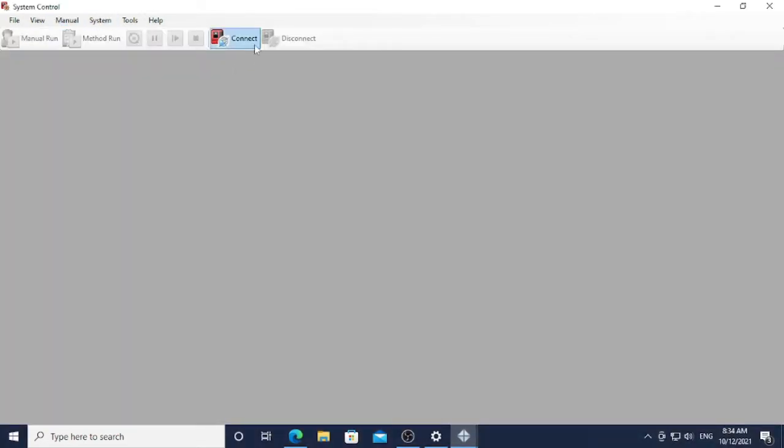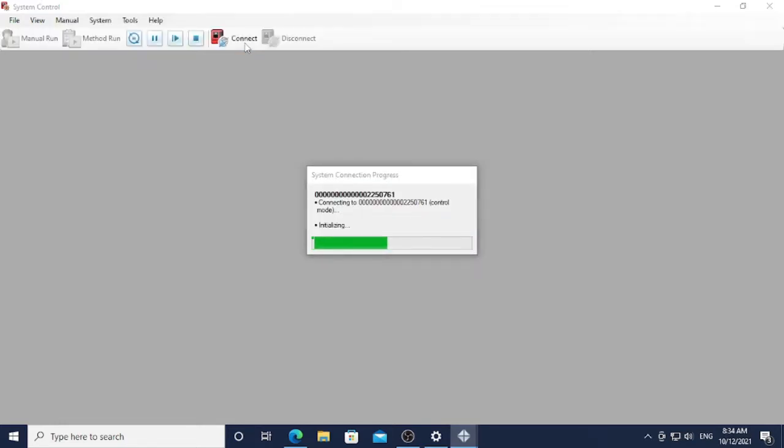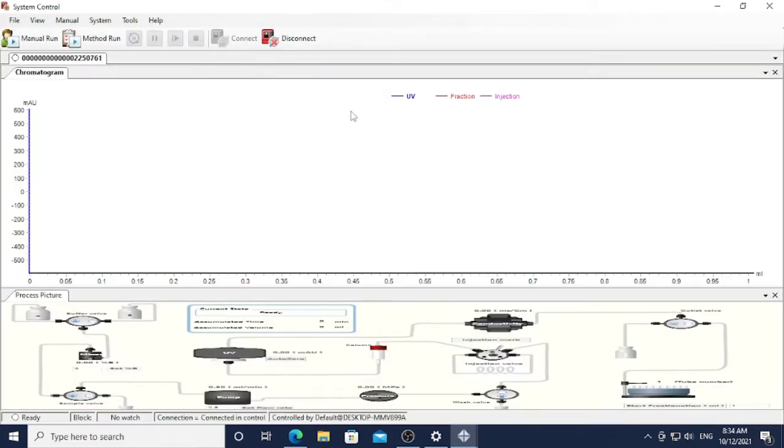First of all, you have to connect the ATASA system with your computer, so press the Connect button. The system is now ready to be used. For any first run of the day, you should clean the pump and also your column.